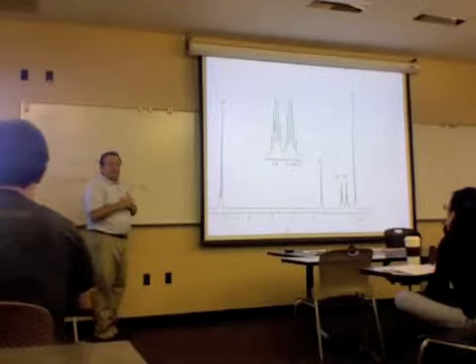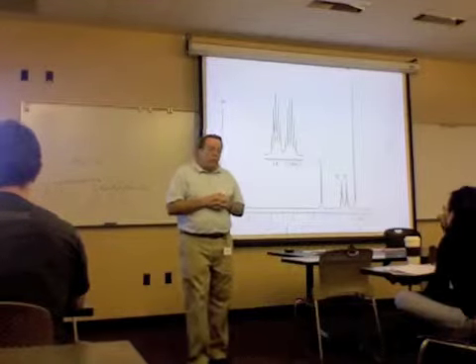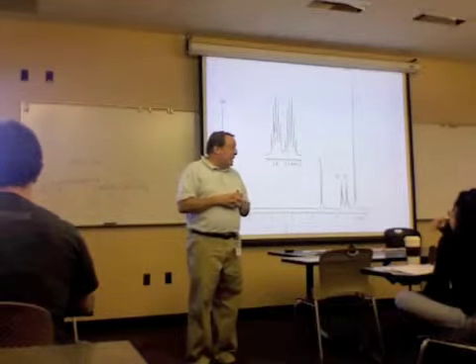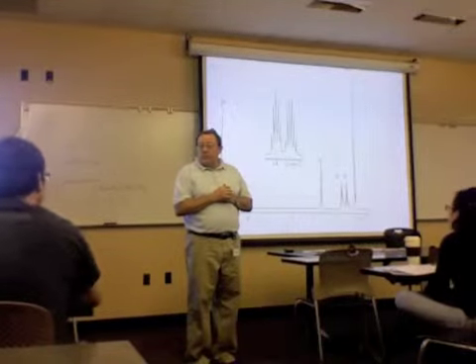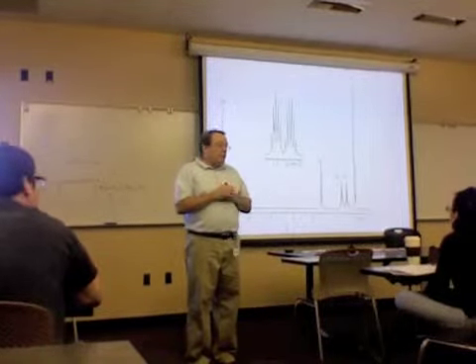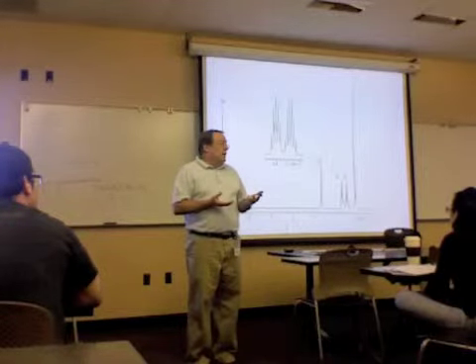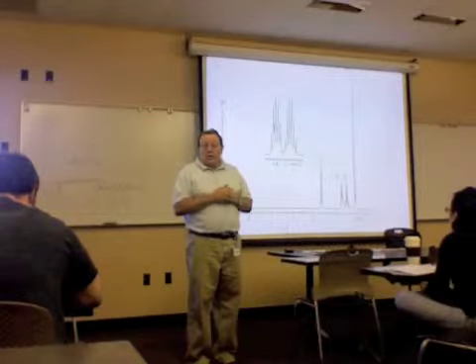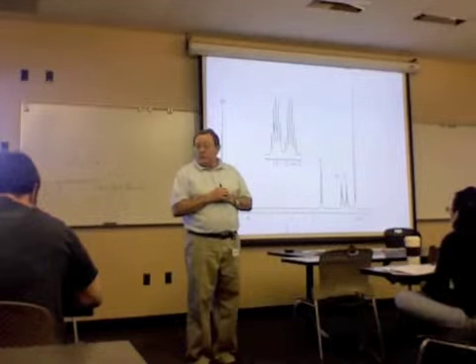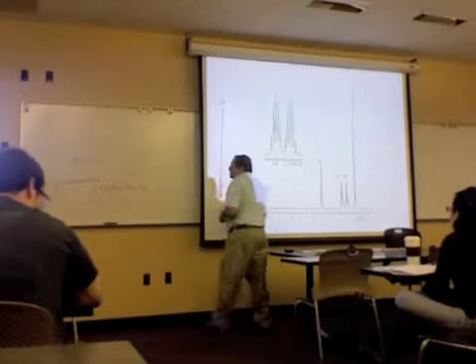Does that make sense? Now, we know this particular spectrum, which was out of a book that comes from 1979 or something, didn't have that kind of technology available to them at that point. But just recognize that if you work in a facility where they've got high budgets for NMR equipment, that kind of coupling constant analysis could help you as well. All right?